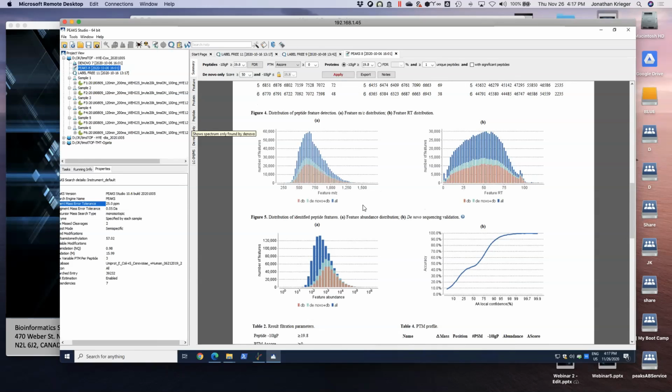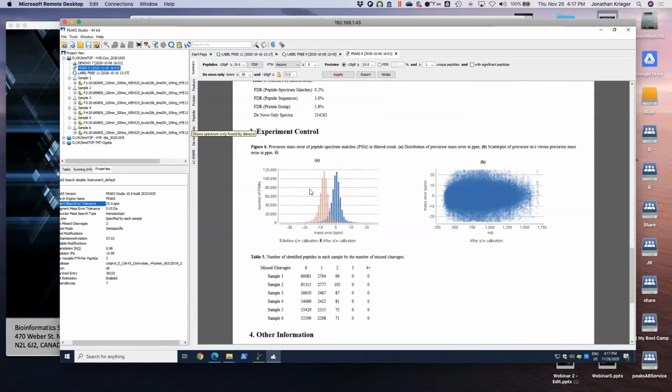Most of the graphs that you see further down are just standard. You get your m/z distribution, you get your feature abundance, and if you scroll down a bit, you also get your software mass error. This is why I'm a bit wider on this one, Priya, because I know that the machine was calibrated slightly off, and that the data was off. To answer your second question, you can go down to 10 or 15 ppm and 0.02 Daltons, and certainly it is high enough accuracy to do de novo with. But I am a bit wider here because I do know that the calibration of the published data set is off, centering around -9 ppm in error. So I wanted to widen it out a bit so I could get the shoulders of the error as well. But we do correct that in the software.